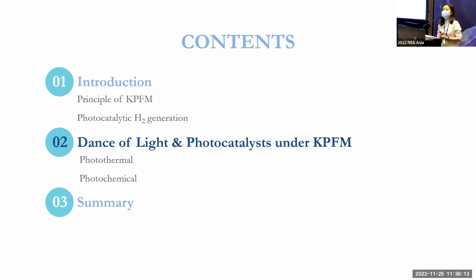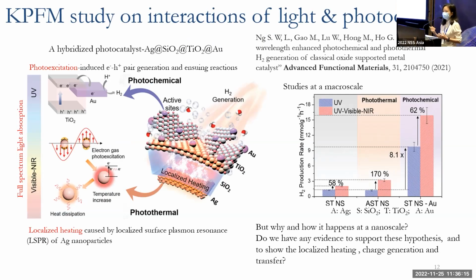In this show, we will see a KPFM case study on a hybrid photocatalyst, which was developed by my colleagues at NUS. And this related work has been published in Advanced Functional Materials. If you need more information, you can refer to this paper.